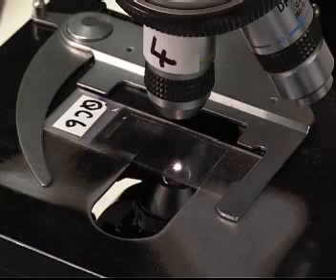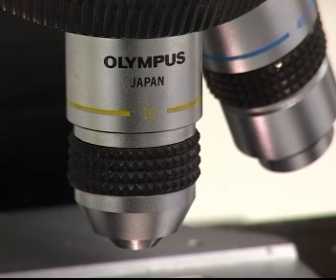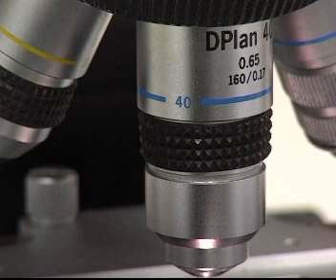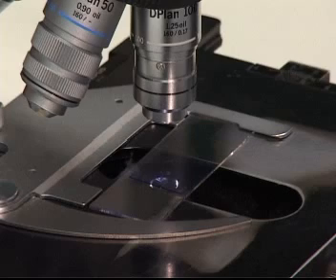Notice that the shorter objective, or the low power objective, is labeled 4 times. The middle power objective has a magnification of 10 times. And the high power objective has a magnification of 40 times. In some cases, your microscope may have an oil immersion objective, which generally has a magnification of 100 times.